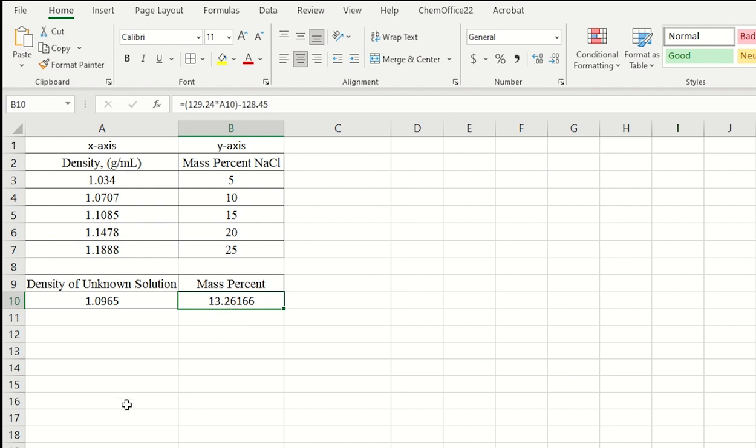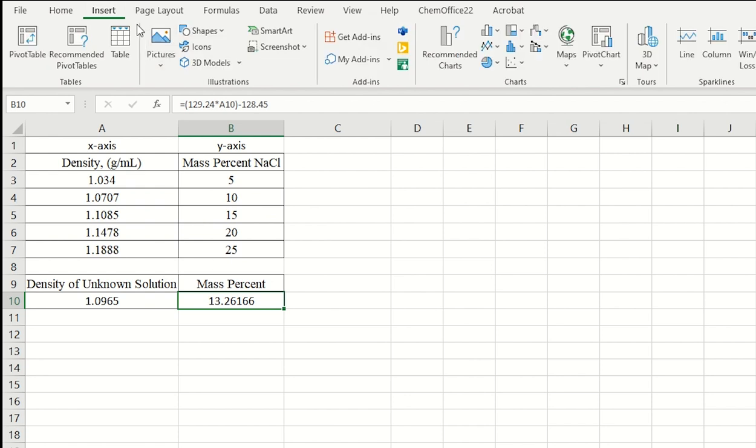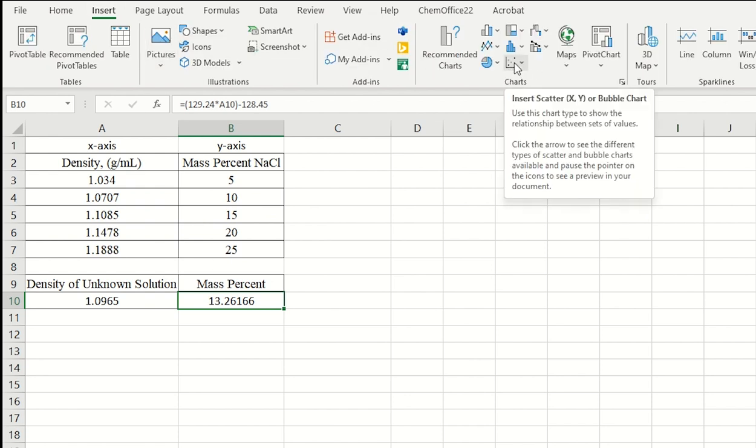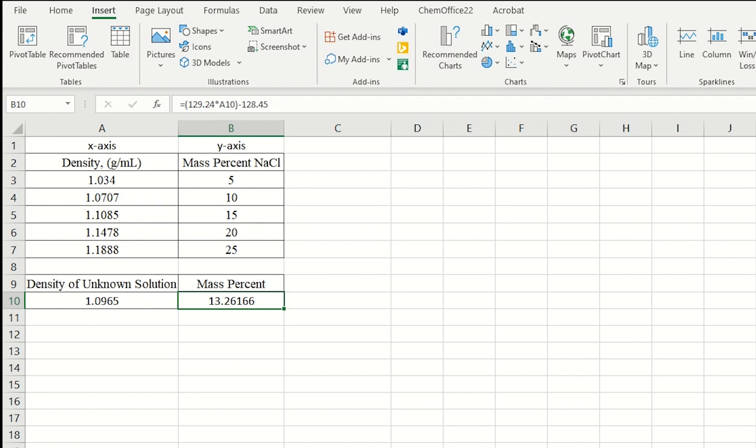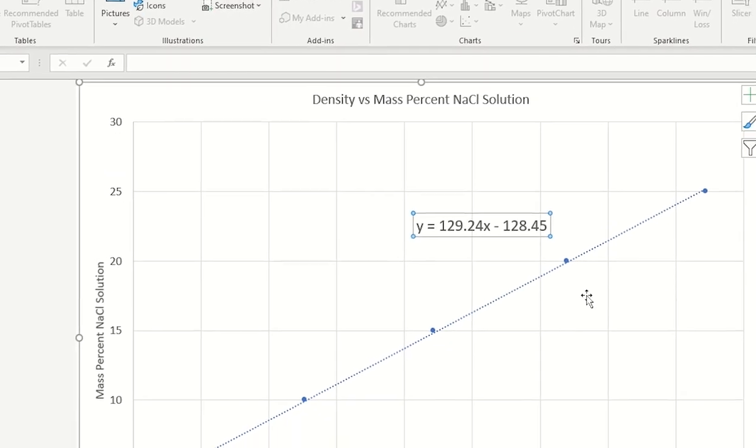So let's do a quick recap here. What I did was I showed how to create a graph from our data. On the left-hand column, I used the density from my experimental data. On the Y column, on the right column, I used the mass percent, the known mass percent from my experiment. When I highlight both, I go to insert the XY scatter. And I get a chart like this.